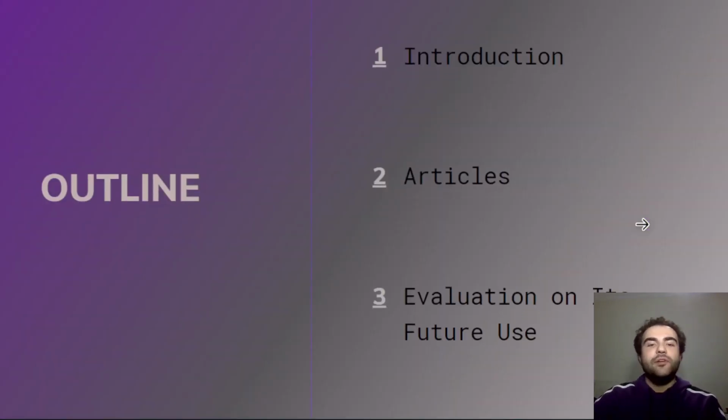I'll start with a brief introduction to what the fluorescence activated cell sorter technique is. Then I'll explain its working mechanism, using some examples from exciting articles. And finally, I'll evaluate its future use.